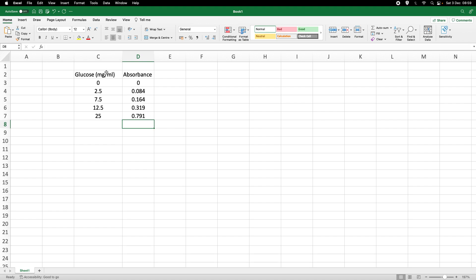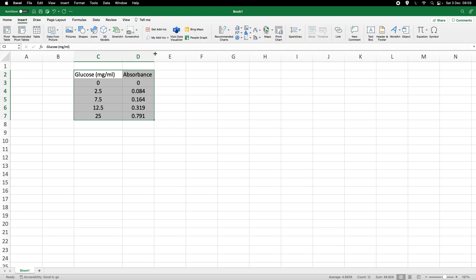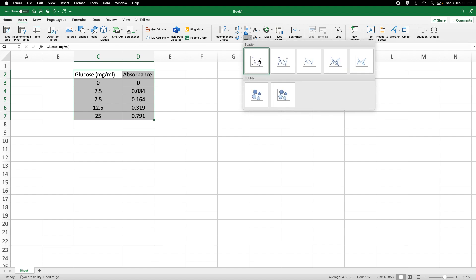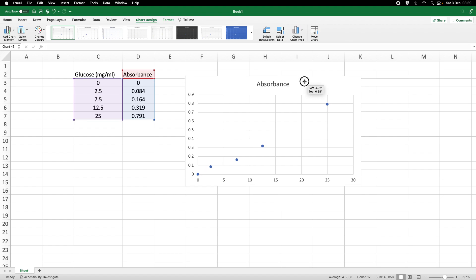Now let's draw a simple graph. I highlight the cells with a left mouse click, go to Insert, and up in the ribbon I choose the XY scatterplot — just the dots. Here is the graph, and it looks reasonably linear.